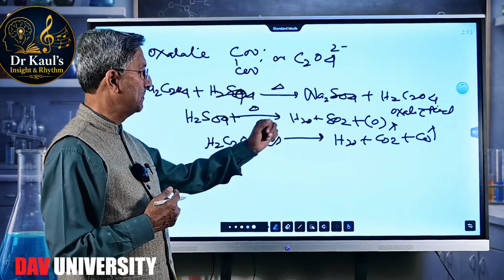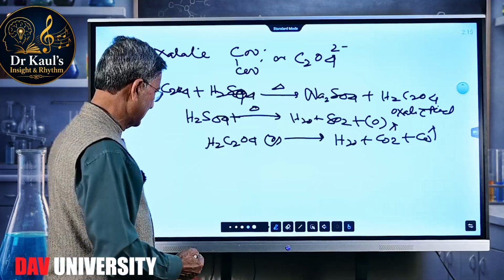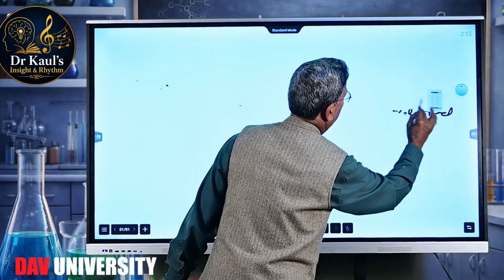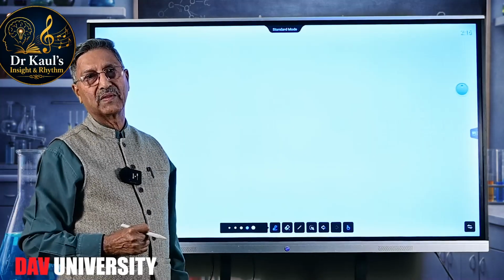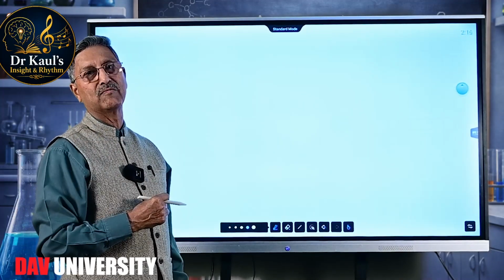So sometimes we perform an experiment to prove the presence of both these gases. What is this experiment? We pass this gas mixture through lime water, and in that case the carbon dioxide is retained by the lime water.